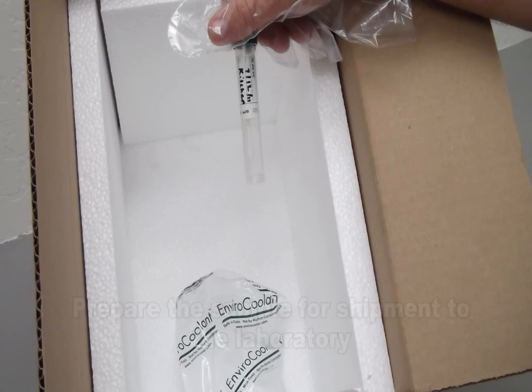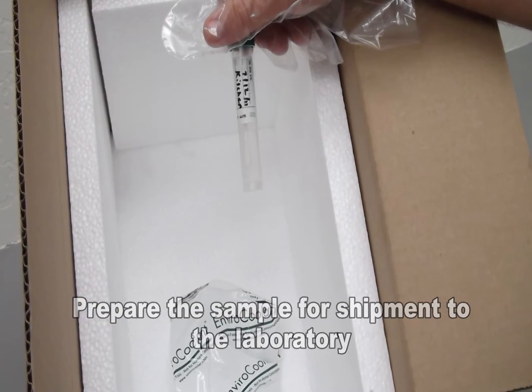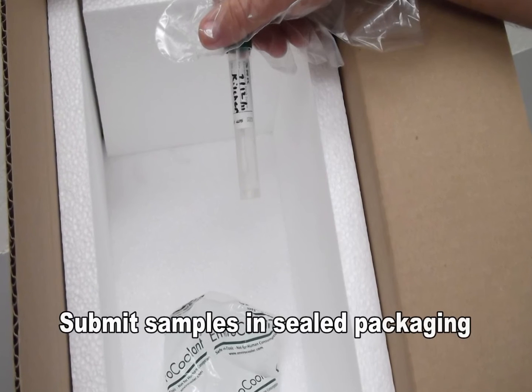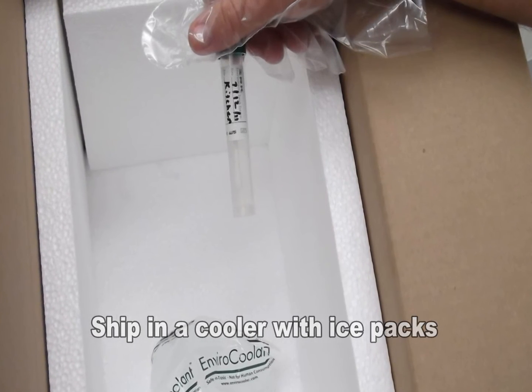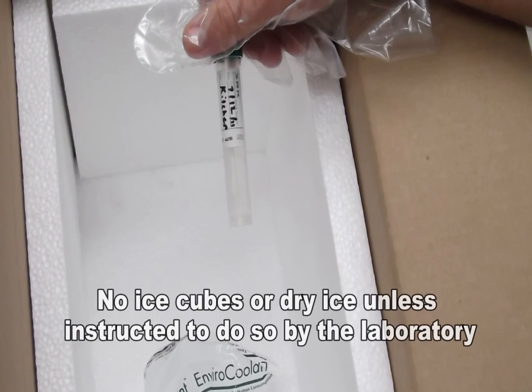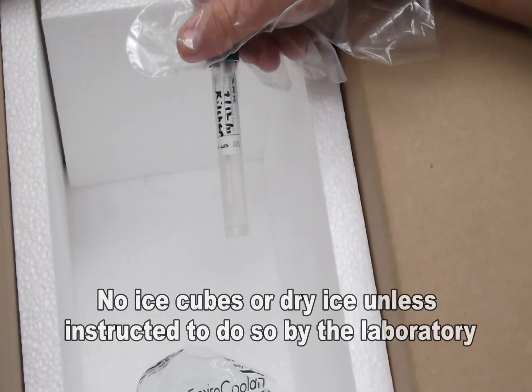Fill out the chain of custody form and prepare the sample for shipment to the laboratory. Be sure to submit the samples in sealed packaging or containers. Ship in a cooler with ice packs for overnight delivery to the laboratory. Please no ice cubes or dry ice unless specifically instructed by the laboratory.